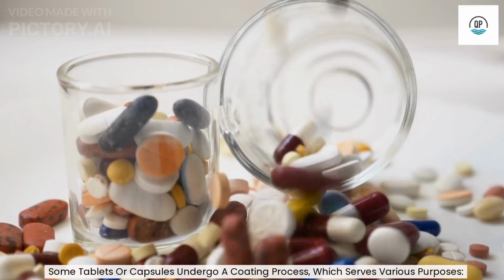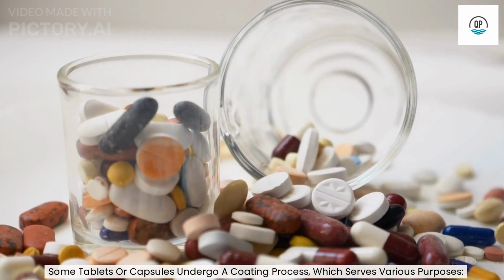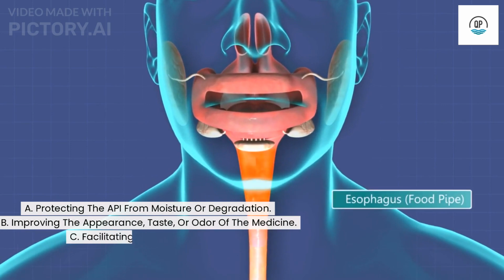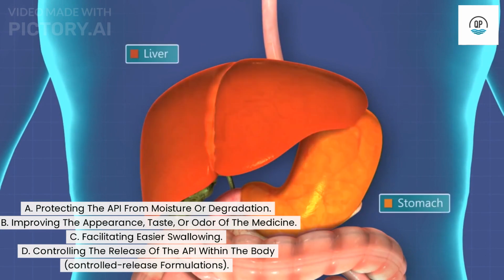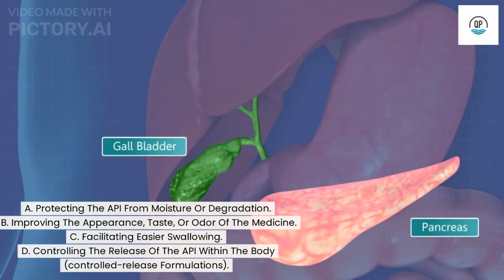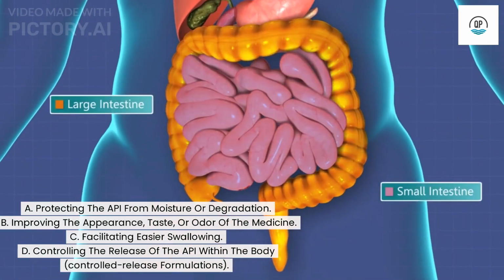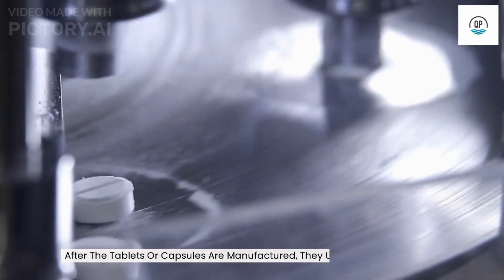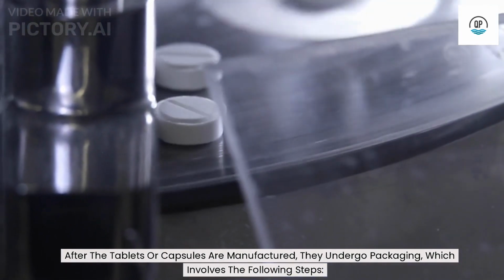Some tablets or capsules undergo a coating process, which serves various purposes. A. Protecting the API from moisture or degradation. B. Improving the appearance, taste, or odor of the medicine. C. Facilitating easier swallowing. D. Controlling the release of the API within the body, as in controlled release formulations.